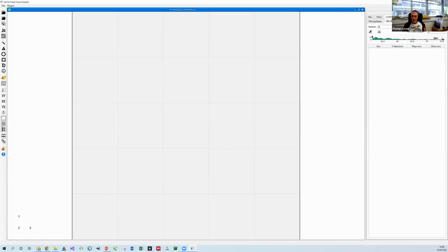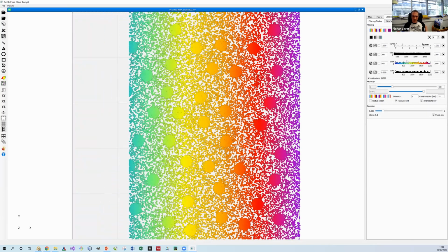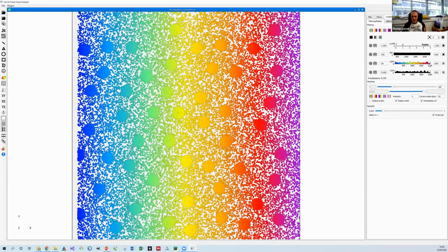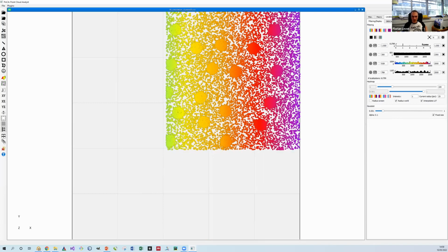I will get rid of the object for now and of the Voronoï, go really to the localization. So I showed you the DBSCAN and the K-Ripley. You also have a few things that you can do directly on the filtering display of the localization. So first, you can do some filtering by going directly to the histogram of your features. So here it's X, Y. Here we don't see, but it's intensity, and here it's frame. So only one frame since it's a simulation. So you can do some filtering if you want, like that.